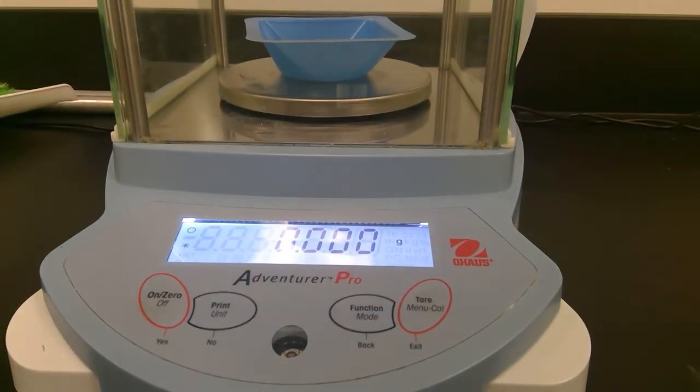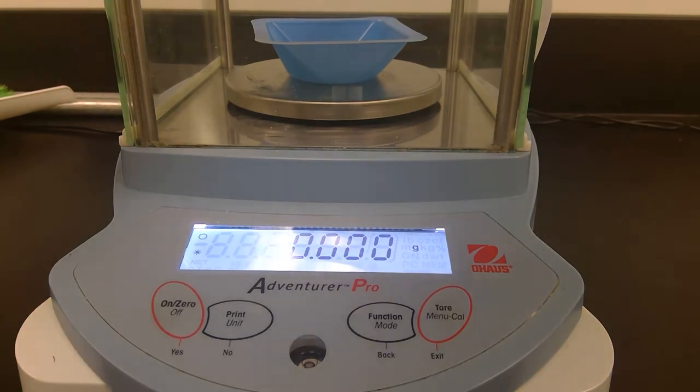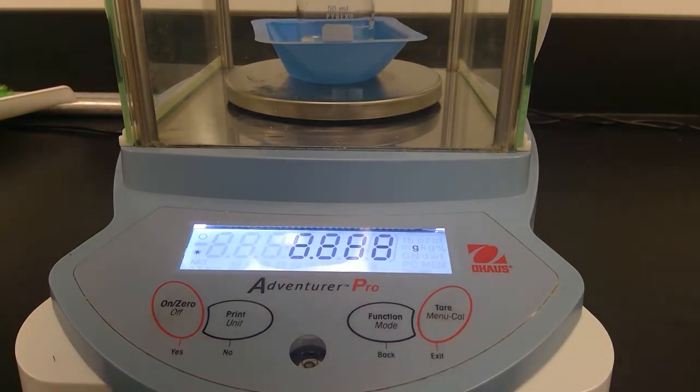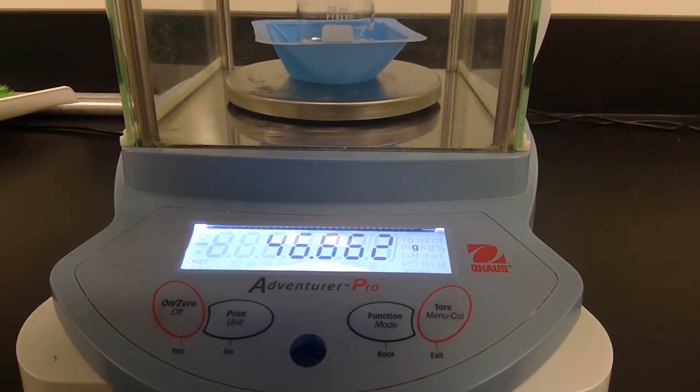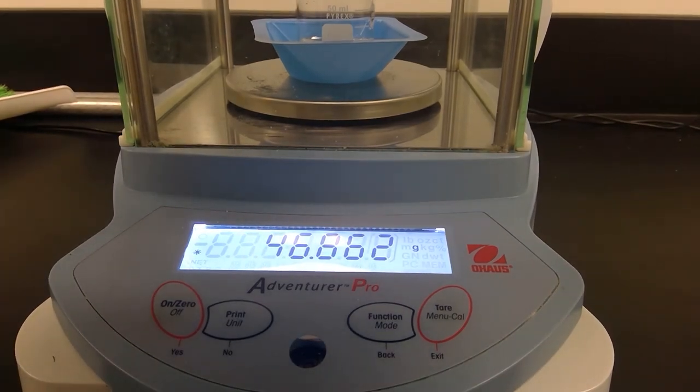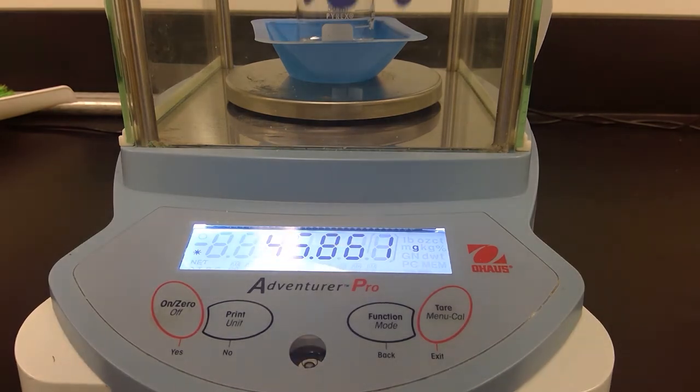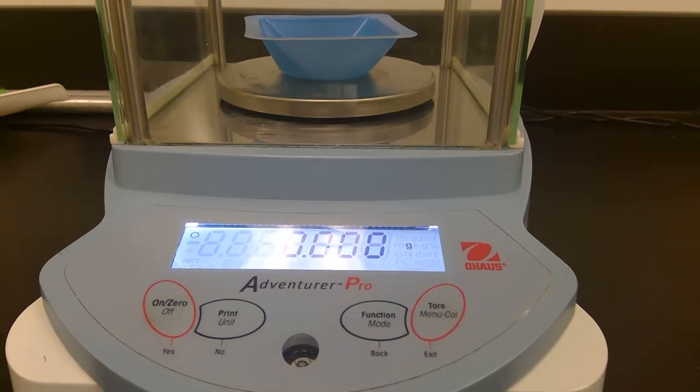Then we will go and weigh our beaker again for our fourth data point. Make sure it's tared. Record the mass of your beaker. Now we will go get our final data point.